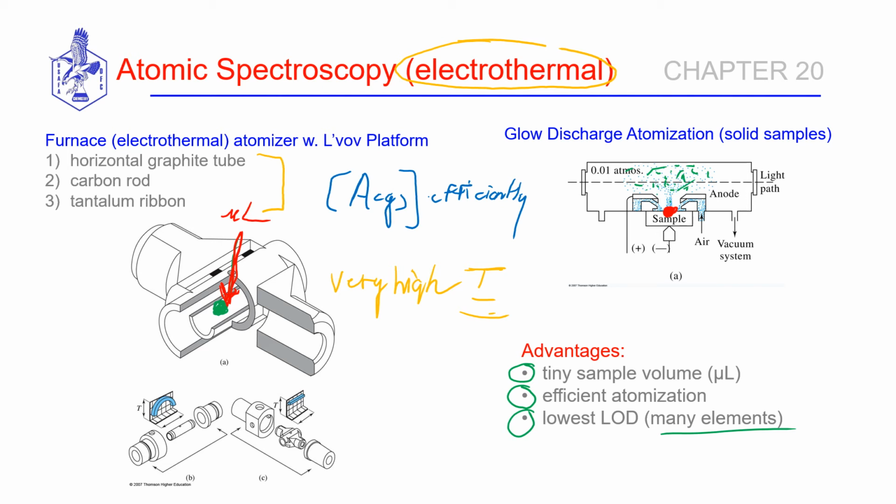So these collective methods can be very useful for direct analysis of small samples, whether they be in solution or liquid form or solid.